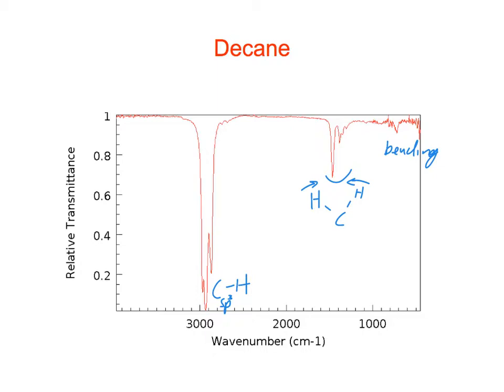You set the pressure up with the instrument, it twists down, pushes the sample against the prism or the glass screen, and then it runs the light through that and samples it. That way you never have to make a KBr pellet. Okay, if you have solid samples. I didn't know if you had used both and knew why one was more beneficial than the other.